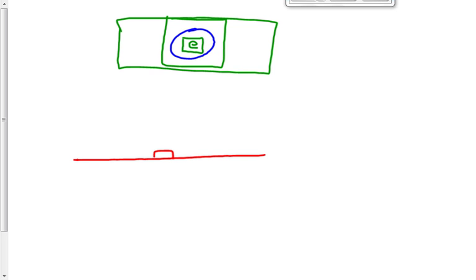Then you'll add a drop of water to that with an eyedropper. As soon as you do that, it's going to flip over, and it's going to turn. It's going to do all kinds of rotten things to you that you don't want it to do. That's fine. What you're going to do then is take a probe from one of the dissecting kits that's up front, and you can just push it down until it soaks up enough water that it sinks, and then you can orient it the way you want. Once it's oriented the way you want, then you'll take a plastic cover slip, which is just a square piece of plastic, and you'll set it on the microscope slide at an angle, and then let it go. It'll drop down onto the slide and squish the water flat. And the E will stay right where it is.